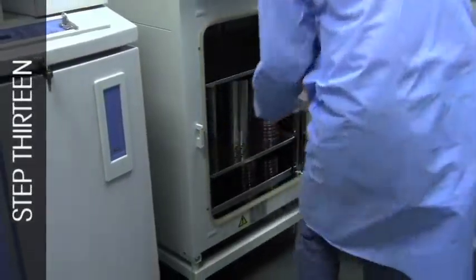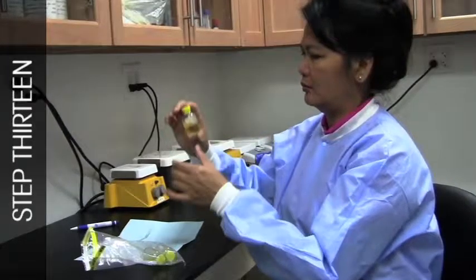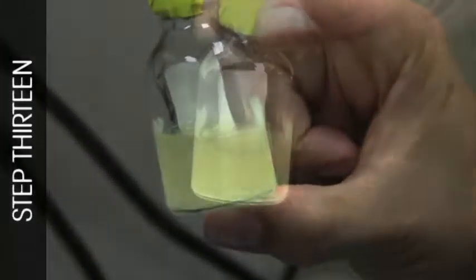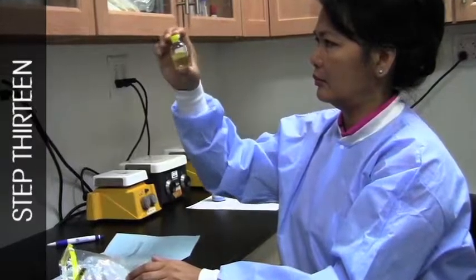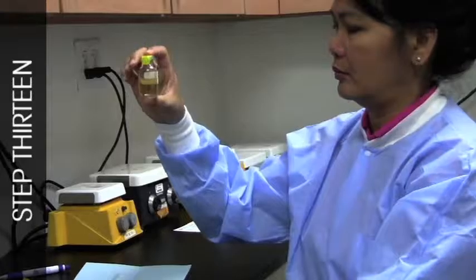Examine the samples every few days for the presence of turbidity or growth of bacteria. Growth may not be evenly dispersed throughout the vial; tap or swirl the vial to observe for growth that may have settled at the bottom. If growth is observed, the vial may be discarded. Do not continue to incubate for the full 14 days.